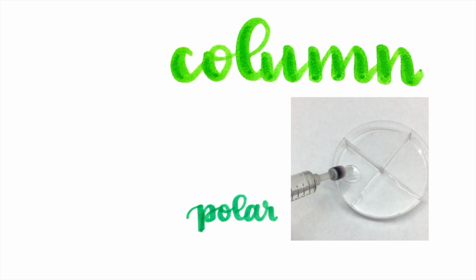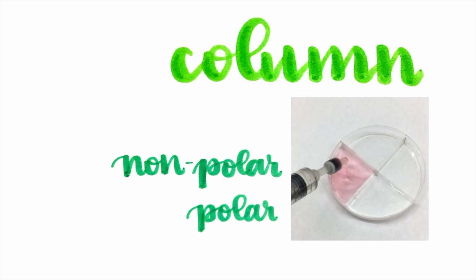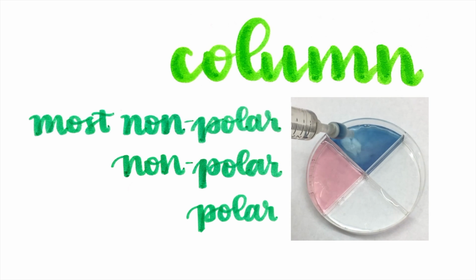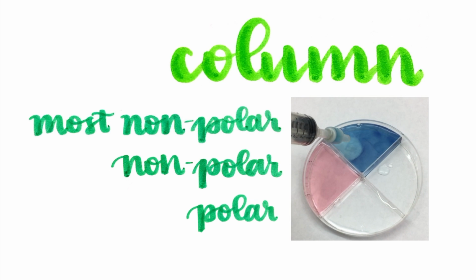The red dye was more nonpolar than the colorless liquid, but less nonpolar than the blue dye, so it was eluted from the column next, with the 5% isopropyl alcohol being pushed through. Because the blue dye was more nonpolar, it was very attracted to the column and was only released when the 25% isopropyl alcohol was pushed through, which is also very nonpolar.